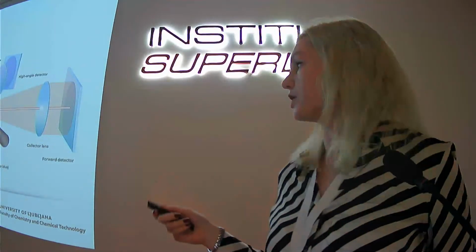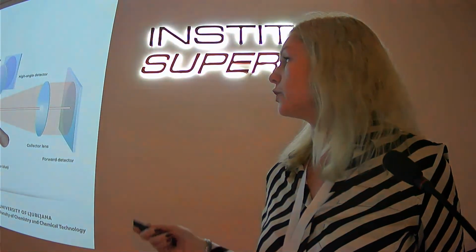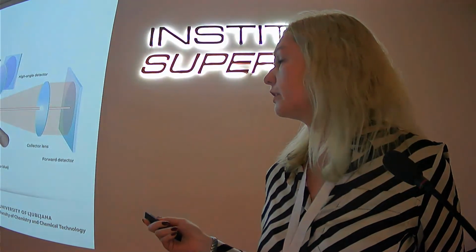This is how the laser diffraction analyzer is working. Here is again the video. So basically, the sample is going through this channel, and you have different lasers and then different detectors that are detecting the lasers. And with the software, it automatically calculates the size distribution, the mean number, and so on.